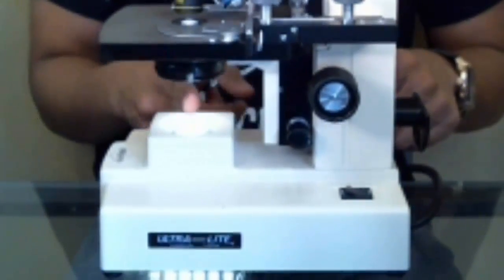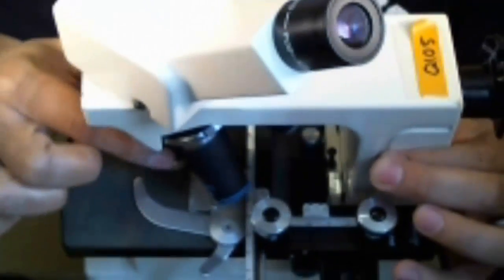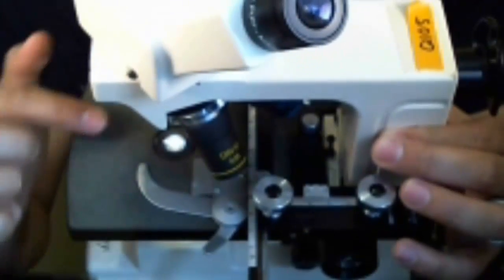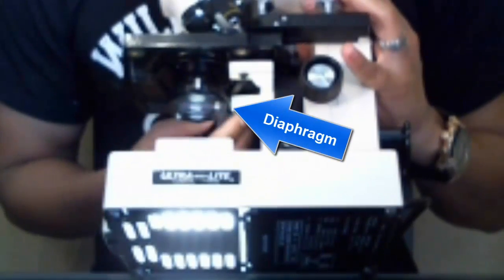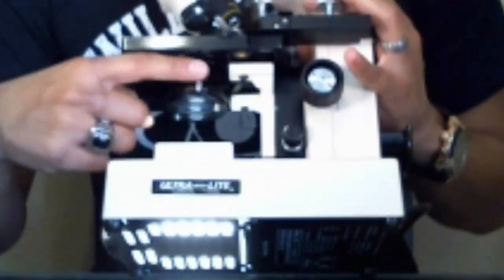The light comes up through the middle of the stage. The stage actually has a tiny hole — this opening is what allows the light to pass through. This opening can be controlled by something called a diaphragm, found right here on the bottom side of the stage. The diaphragm can control the size of the opening on the stage, which in turn controls the intensity of the light allowed to pass through.